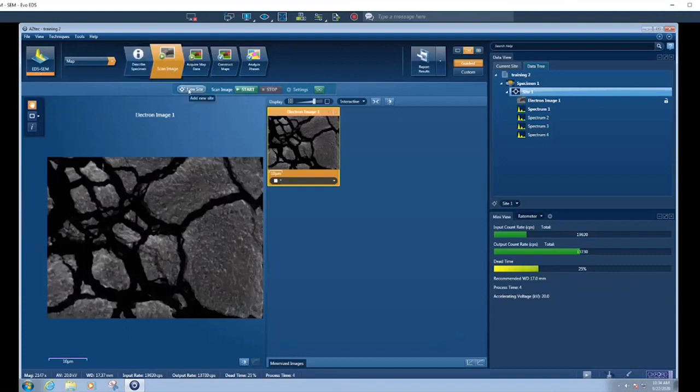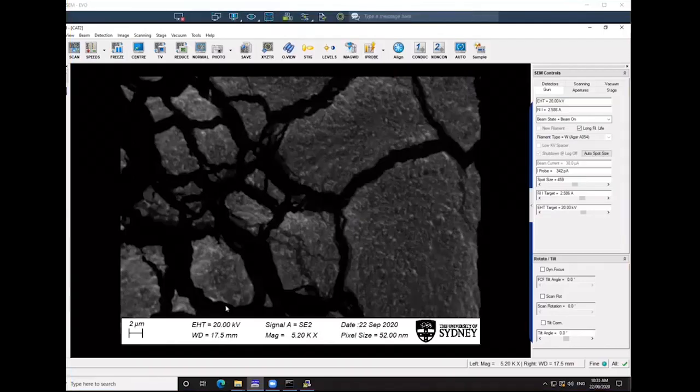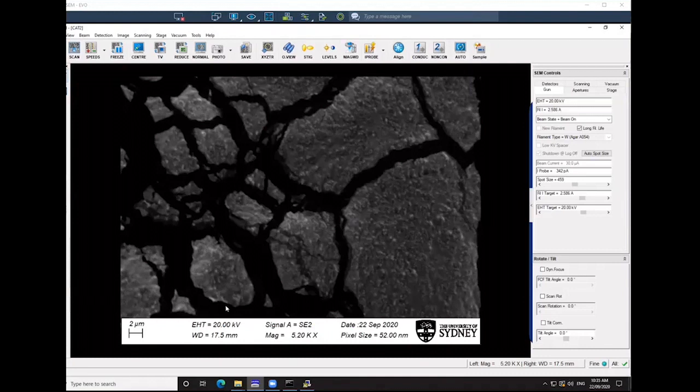We're going to go to a new site, so a new region, new site. We'll go over to the EVO computer, or the SEM computer, and let's go to a different region.